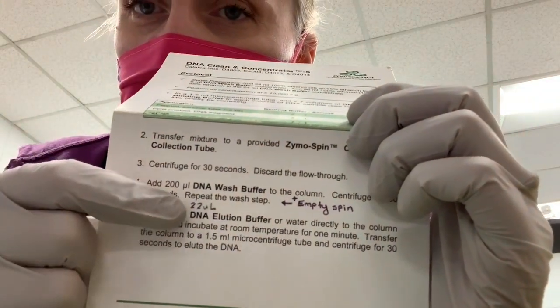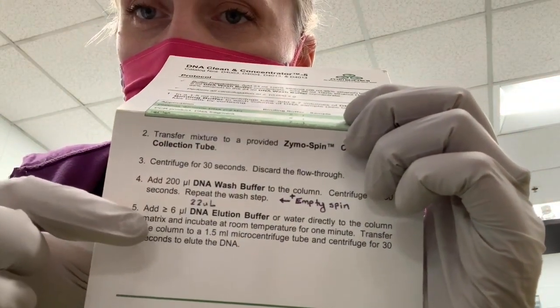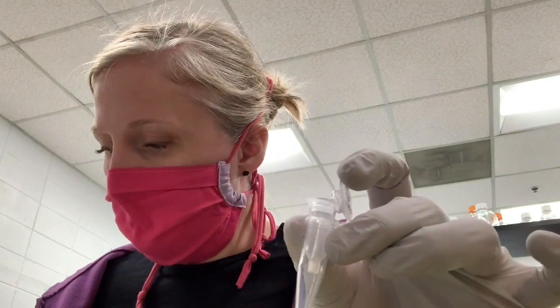This protocol will tell you to add the elution buffer and then transfer your column into a tube. I think that's a recipe for disaster because you could spin and lose your DNA. So I always put my columns into my 1.5 ml tubes, which is my microcentrifuge tube, and then elute. That way I don't get mixed up and spin in the wrong tube. So I'm going to use my filter tip and my RNase-free water. I'm going to elute 22 microliters for each sample.